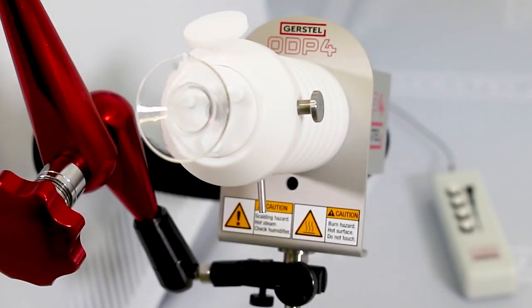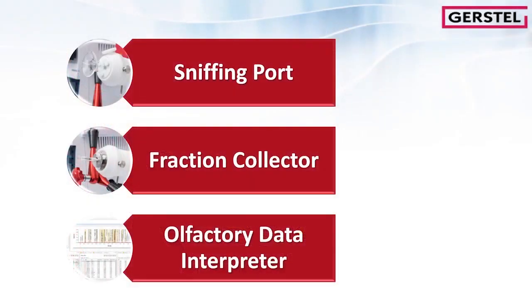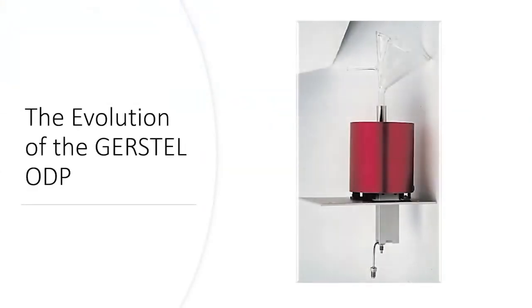Welcome to this video where we show you the benefits of the GERSTEL olfactory detection port number 4. We have divided this video in 3 sections: the sniffing port hardware, the fraction collector configuration and the olfactory data interpreter software. Here we show you the 3 versions from the past.